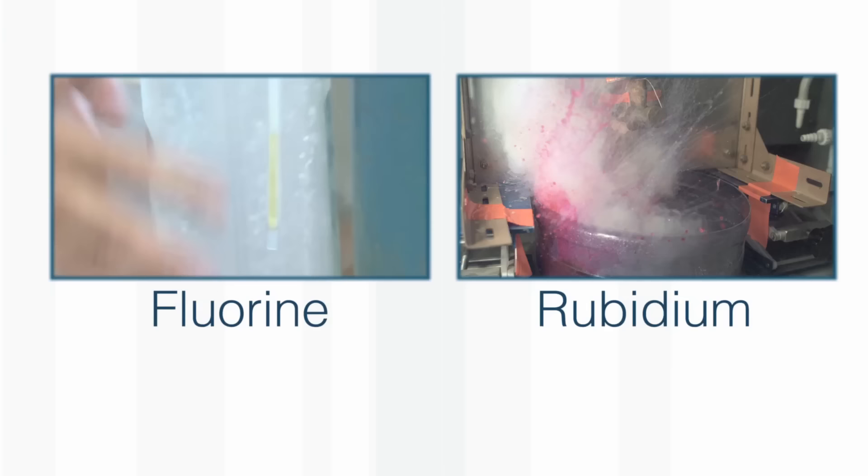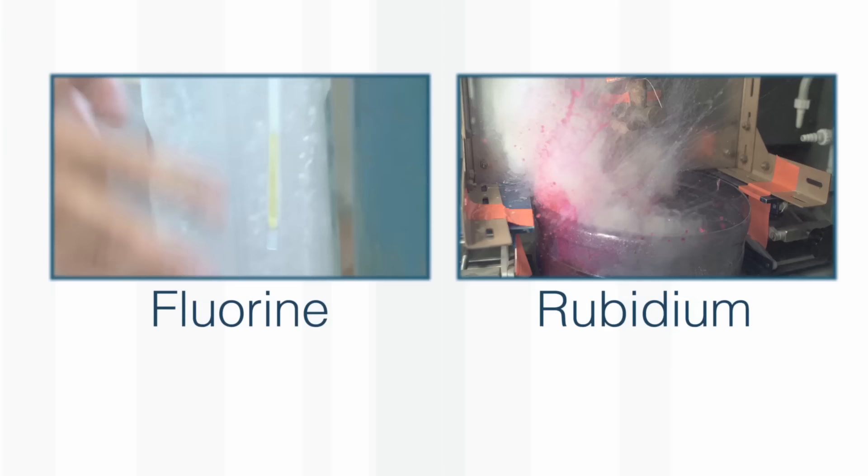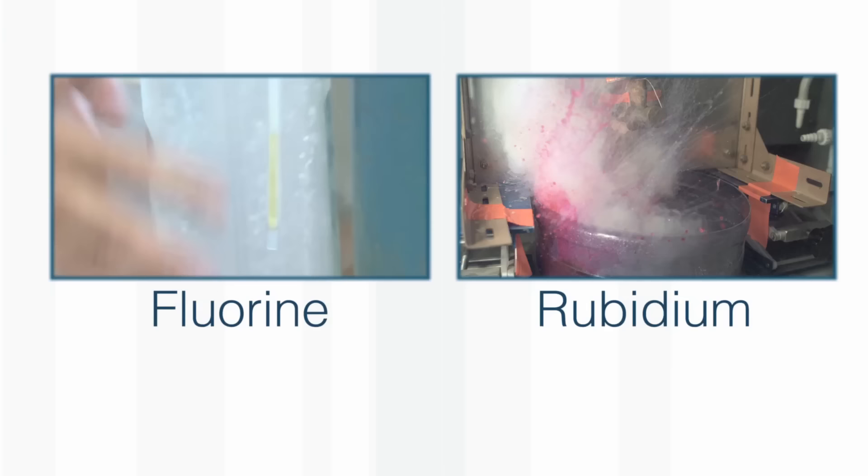Slide this one in, so just slide it away and back up again and there we have nearly two inches of liquid fluorine. You can go right up, there's no problem with that. Yeah, I'm really surprised. I thought it would be pale green and it's really quite dark yellow.